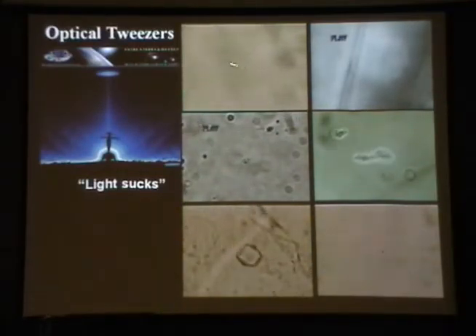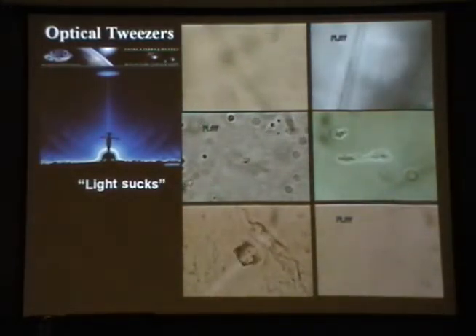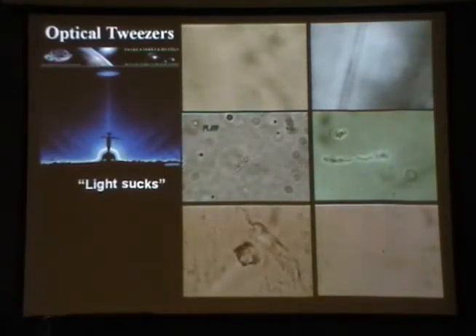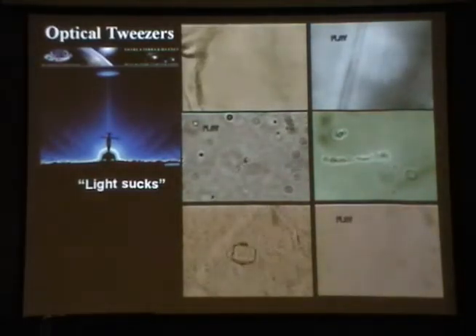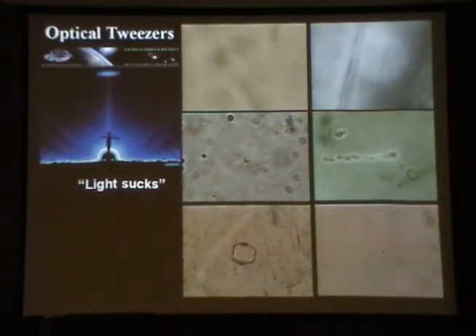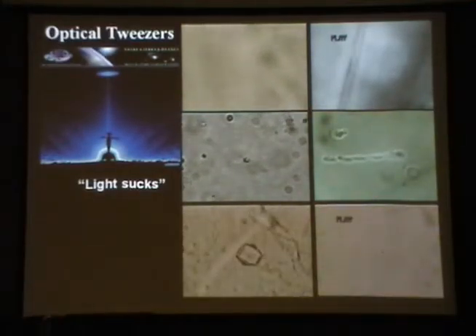You can use this to punch strings from the membrane layer of your onion cells. You can move the red blood cells. We can trap bacteria and they stay alive there. You can see that when you turn off the laser, they go away quite happy. Actually, sometimes we trap one, two, three, depending on the power of the laser.